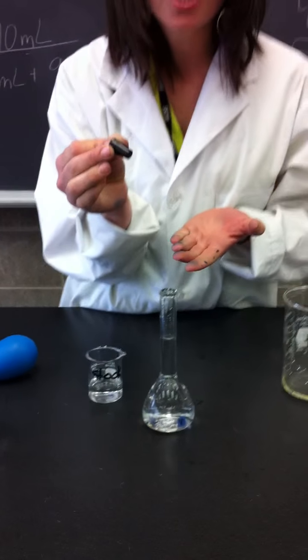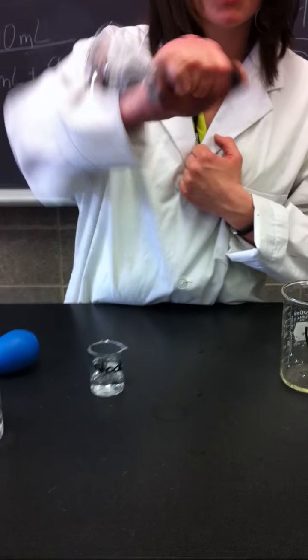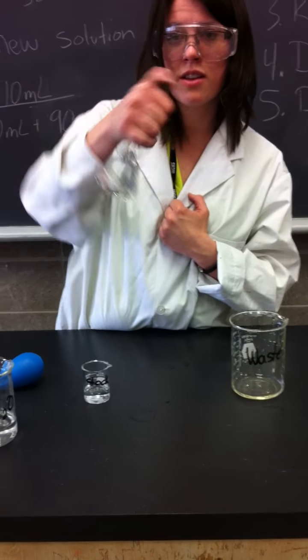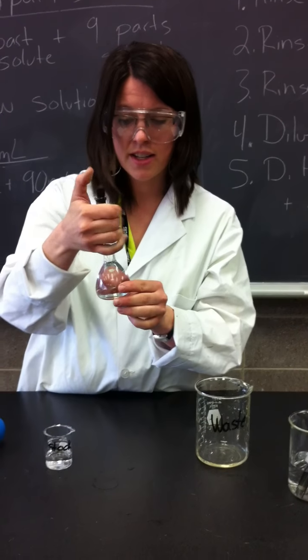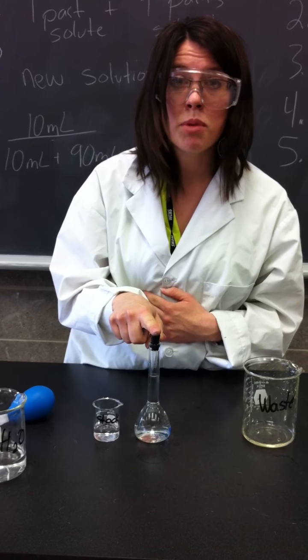So now I'm going to stopper it. I've already checked my stopper to make sure it fits appropriately, and invert 3 times. 1, 2, and 3. All right, so now that was my first dilution, 1 part, 9 parts.